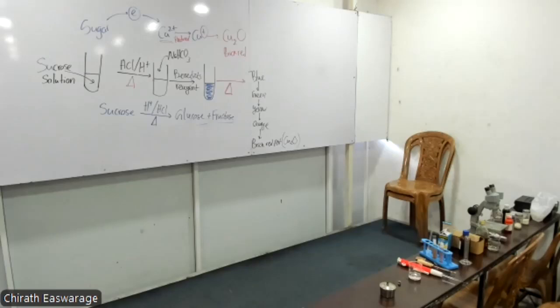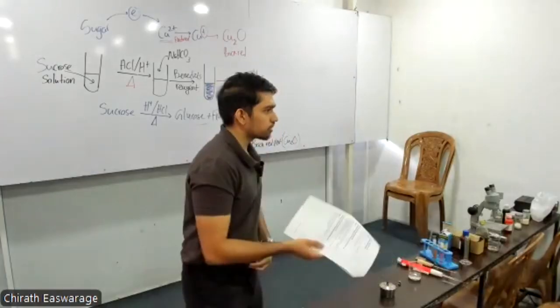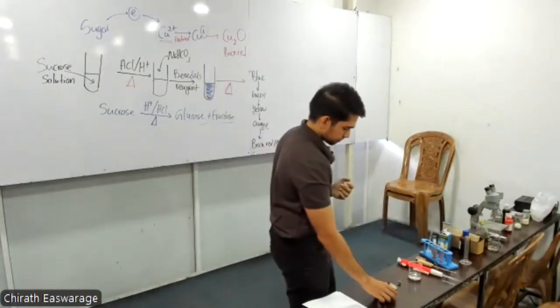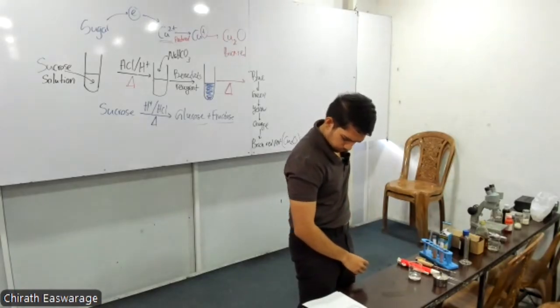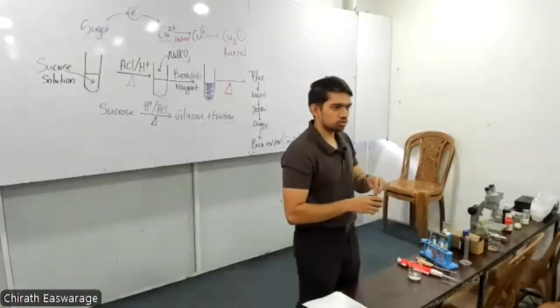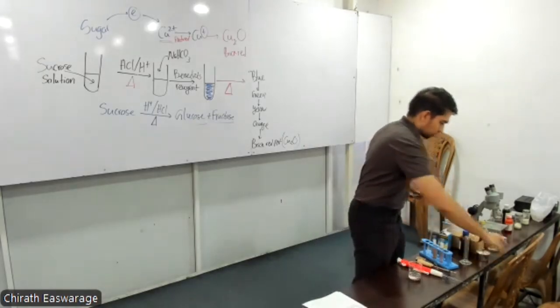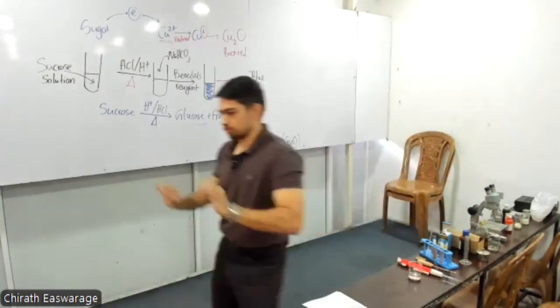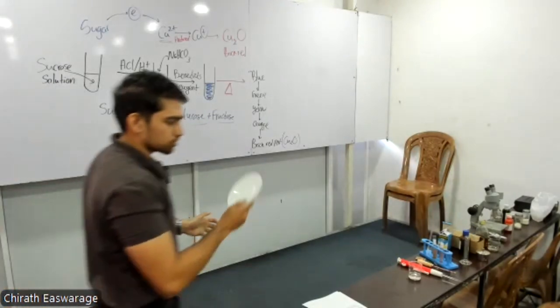Shall we check proteins or starch? What do you want to do? Carbohydrates, let's do starch, right? So, anyone wrote bread, right? There's no other heating to be done. If you want, you can do the fructose after the class. Let's use some proper starch as well as some products of starch.